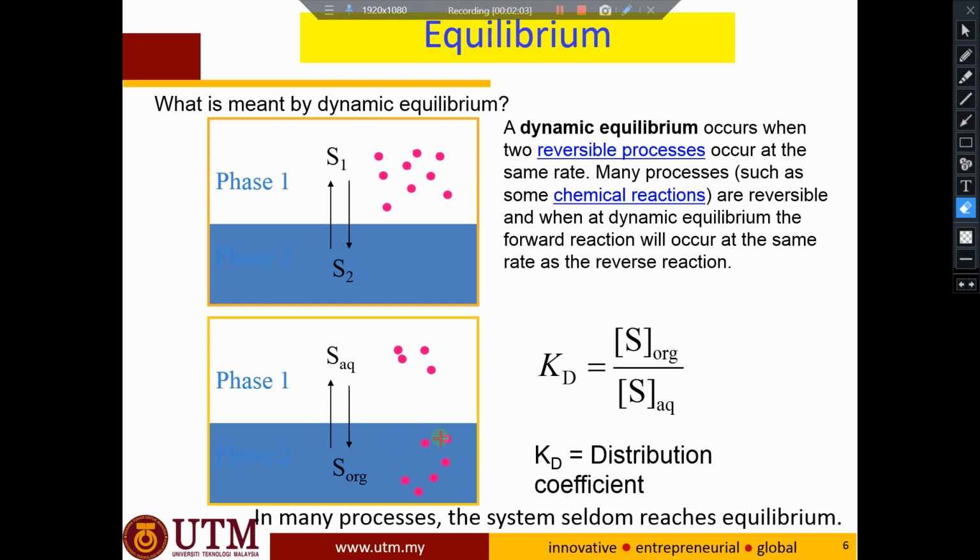So for example, if you have too little organic phase, you don't achieve the dynamic equilibrium, then your analyte is left behind here. This one is what was transferred. But if you get the correct concentration of the organic phase, you can transfer all your analyte of interest inside here. Okay, this is how we can relate the equilibrium with the liquid extraction.